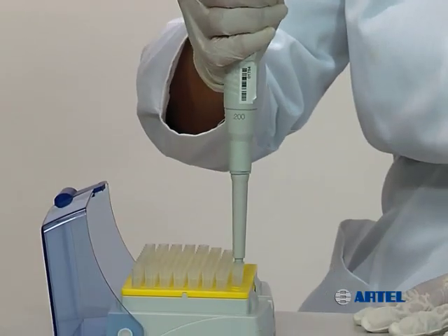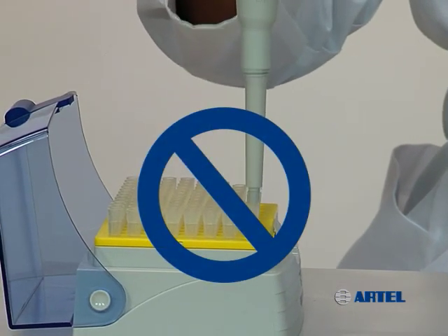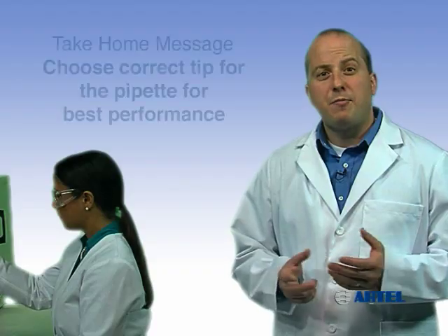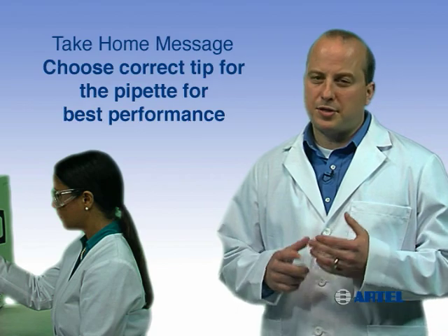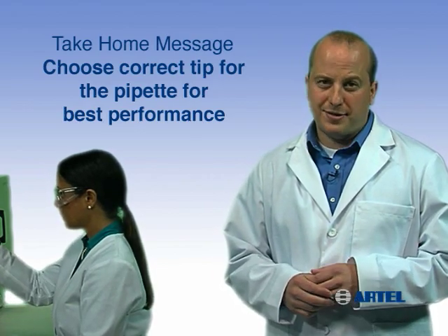When placing a tip on the pipet, do not use excessive force, which can cause damage to the pipet nose cone. The take-home message is: proper tip fit is important to ensure a tight seal between the pipet and the tip, and sample loss due to leakage will be minimized.